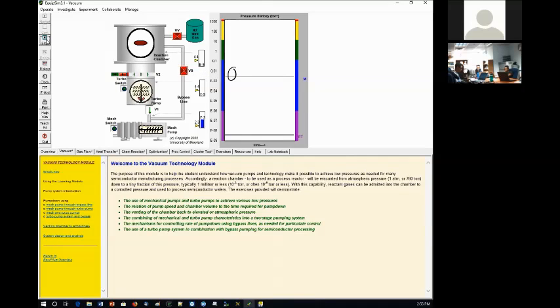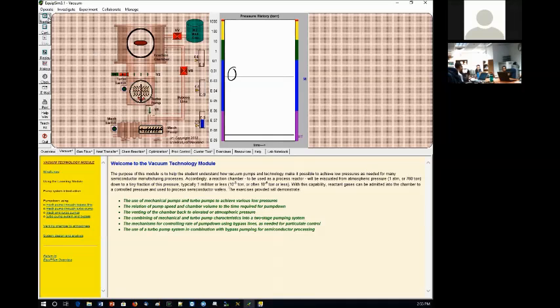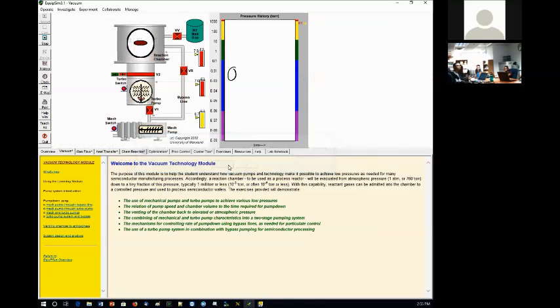So I'm gonna stop this program, and then I will run it one more time. Okay, now what I'm gonna try to do is turn on the mechanical switch, and then I will open this valve again between the mechanical and the turbo. Good. But instead of turning on the turbo, I will open this B2, the high vac valve.